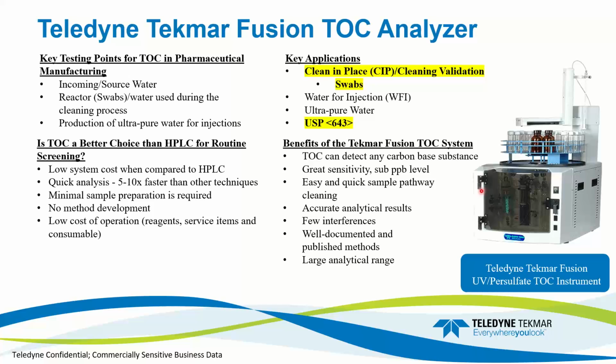Then, as we go deeper into the methods, which was one of our topics today, we're going to be looking at clean in place, CIP, or cleaning validations with swabs. A method that we're not going to be touching on, but will go over a little bit, is water for injection, WFI, or ultra pure water. And then we're going to specifically talk about USP 643. Those are the key applications that this system is made for, along with drinking water for environmental purposes.